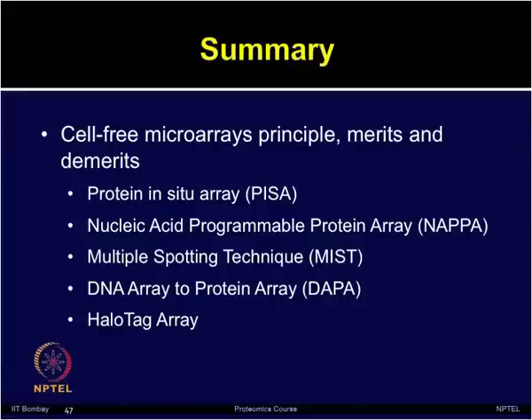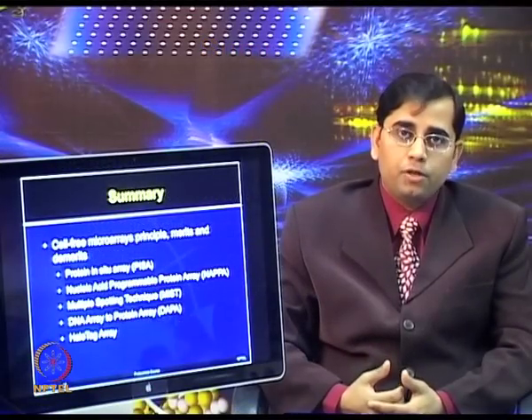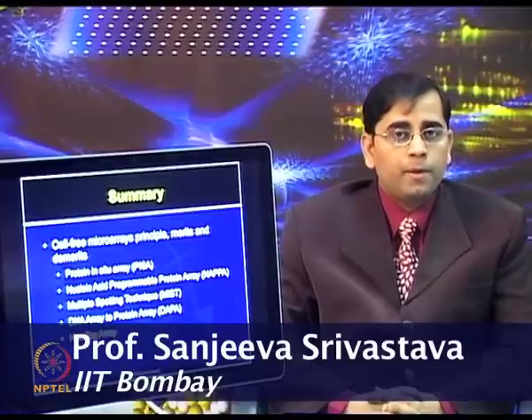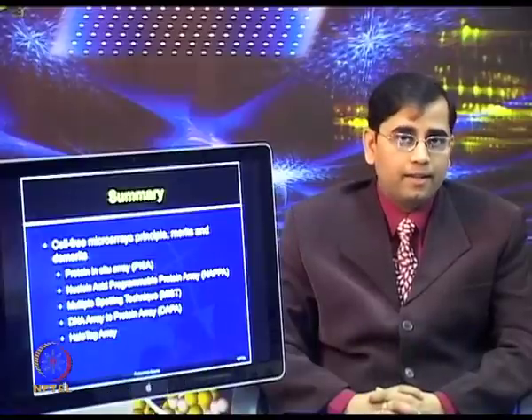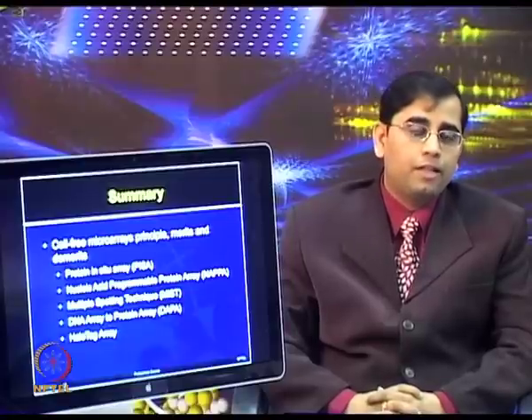So, several cell-free expression systems have been developed during the past decade, and today we have discussed the working principle, merits and demerits of some of the promising cell-free expression based protein microarray systems, including protein in situ arrays, nucleic acid programmable protein arrays, multiple spotting techniques, DNA arrays to protein arrays and HaloTag arrays. There are other promising approaches as well, which also involve similar principles.